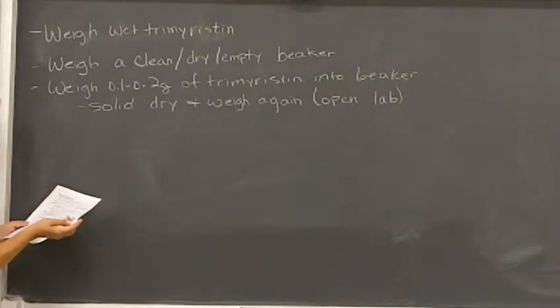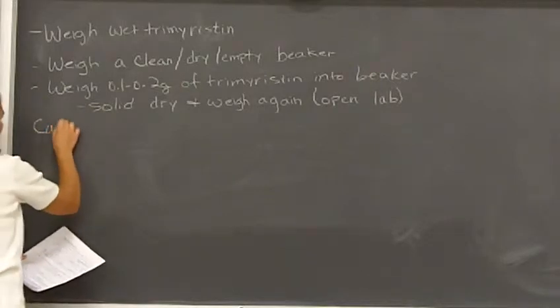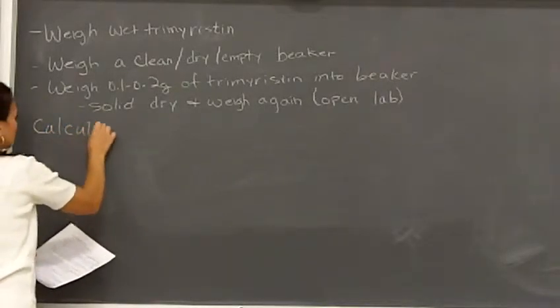Then what we're going to do is calculate the percent mass that was actual dry trimyristin.